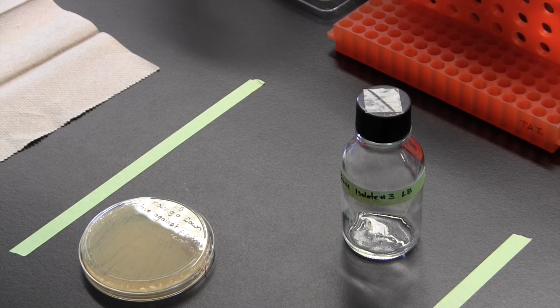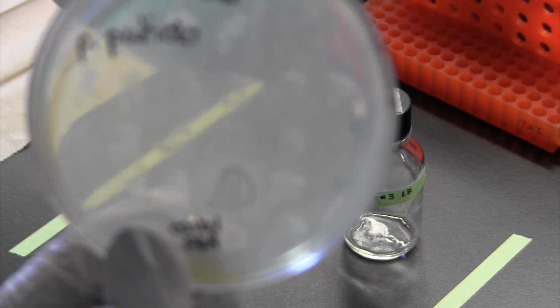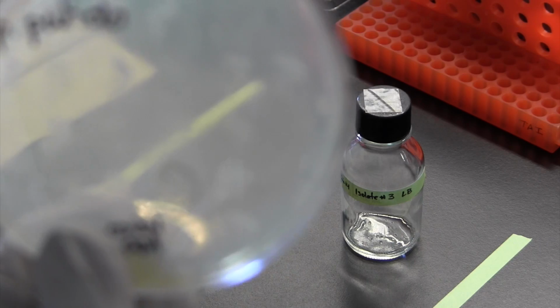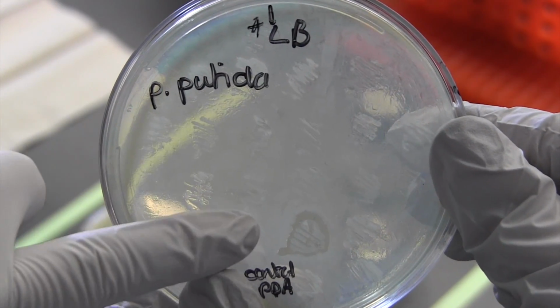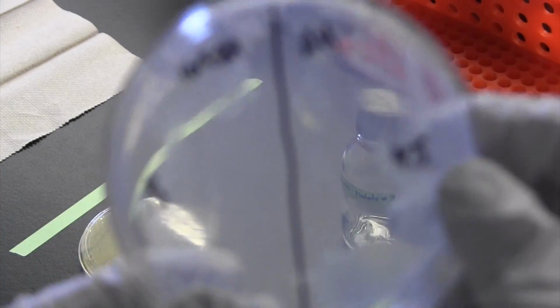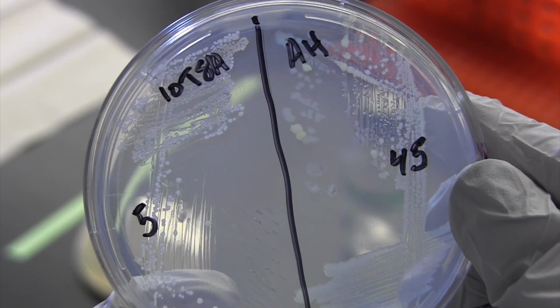So just to remind you, what we've done so far, hopefully, is that your students have done a spread patch and have isolated candidates that produce these nice clear zones of inhibition. And from those environmental candidates, they've hopefully made isolated colonies using a T-streak or quadrant streak or whatever you want to call it. So you'll hopefully have something like this where you have nice, clear, isolated colonies. There'll be some other activities you're doing in parallel. You might be doing your PCR analysis, et cetera.